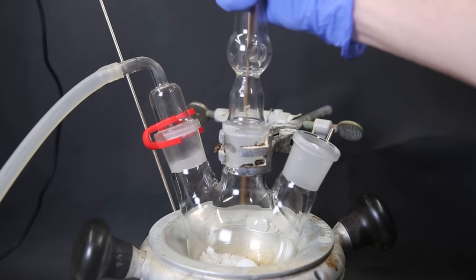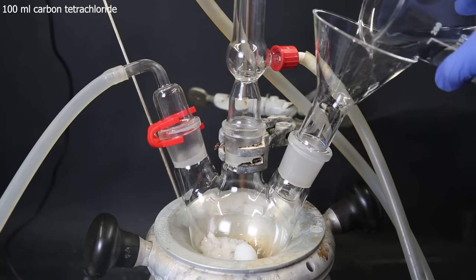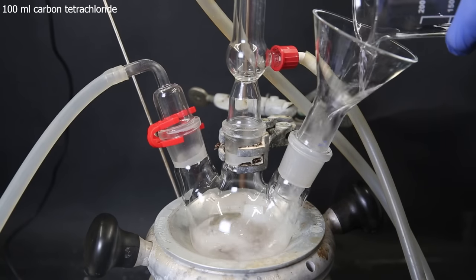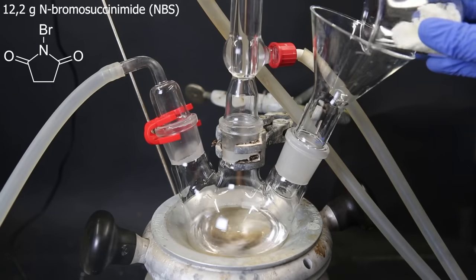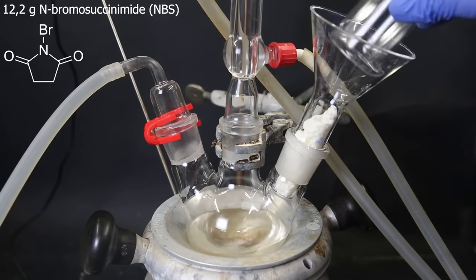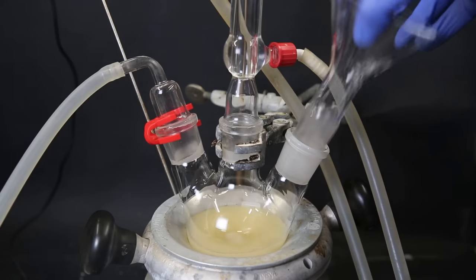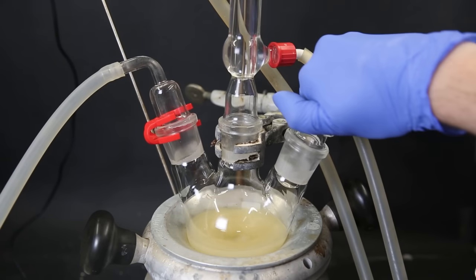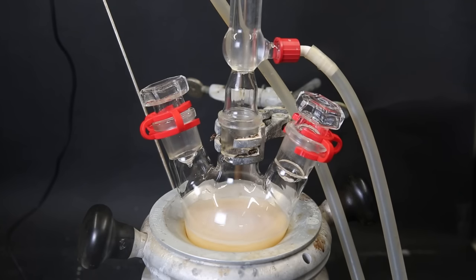I then attach a gas adapter with an argon line, a condenser, and a funnel. Through the funnel, I add in 100 mL of carbon tetrachloride and start stirring to dissolve the crystals. On top of that, I add in 12.2 grams of N-bromosuccinimide, which is the brominating agent for this reaction. Then I remove the funnel and replace it with a stopper. I start heating the mixture to a reflux and remove the argon line. I then leave it to reflux for 3 hours.